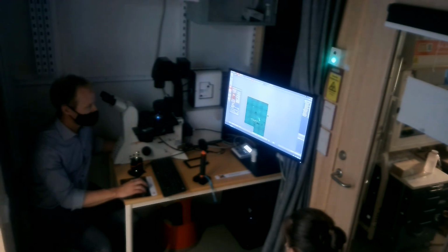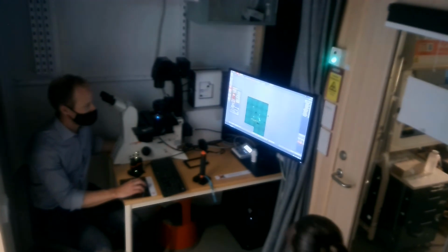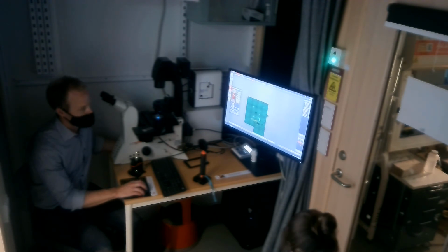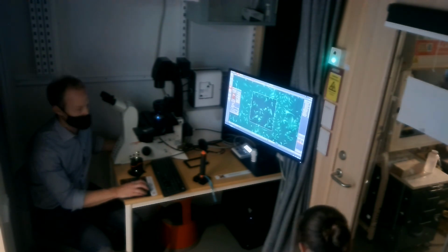So I will just pick a few. That will do the same set stack. But if I untick this, a little button came up, redefine stack. See, the button disappears, but if it's there, this means that I can go in and redefine the stack to this one. So right now this is exactly the stack. You've got this little cube, which means that that one has a unique stack.